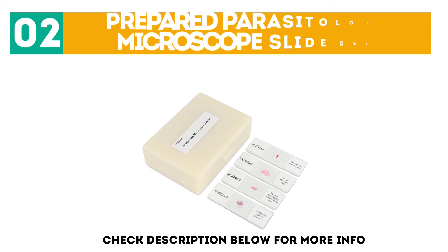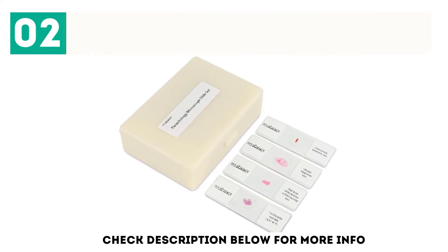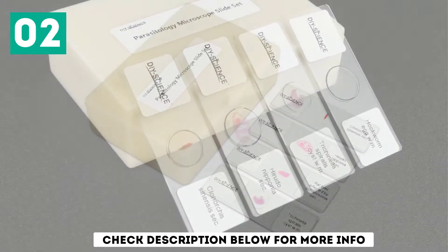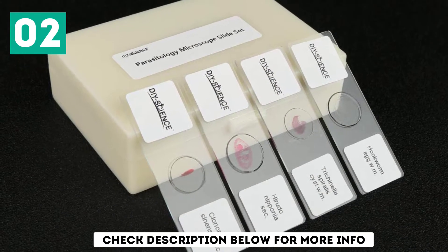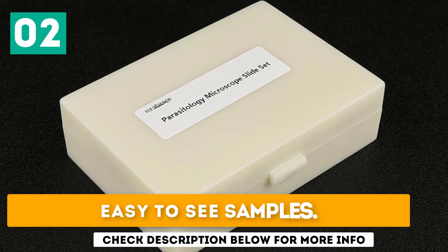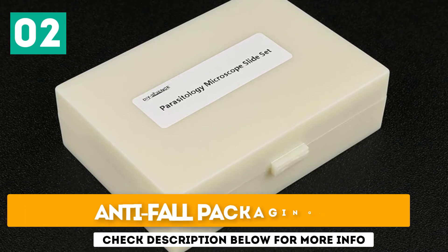At number 2: Prepared Parasitology Microscope Slide Set. These slides are designed specifically for students to explore parasitology. They are well-labeled and protected against dampness, moisture, shock, and breakage, making them smooth to work with for learning. Key features include easy-to-see samples, a friendly prepared slide set, and anti-fall packaging.